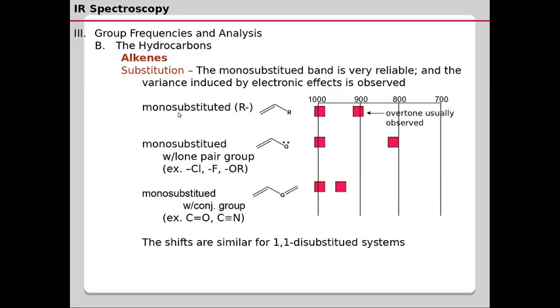Again, when we move on further into the substitution patterns of alkenic systems, we shall be seeing that we can see a lot of different ranges of vibrational frequencies. When we start with a monosubstituted alkene system such as the one here, you shall be able to see two different vibrational frequencies at around 900 centimeter inverse and 1000 centimeter inverse.